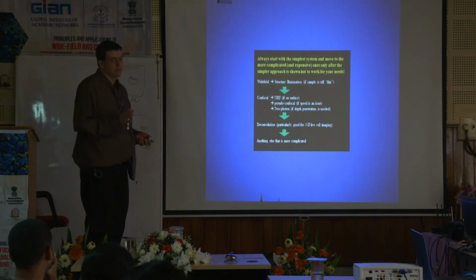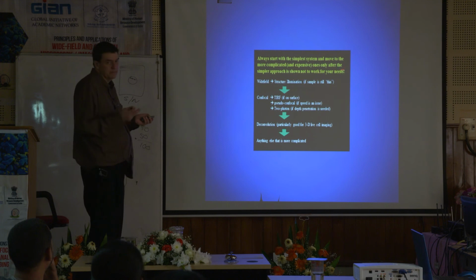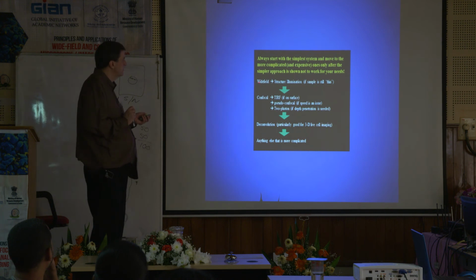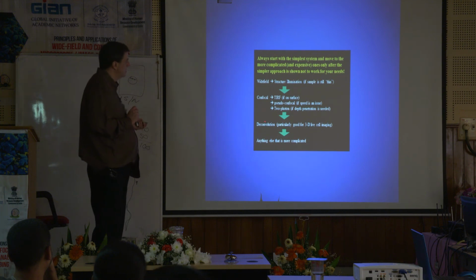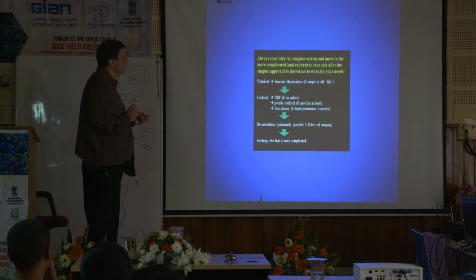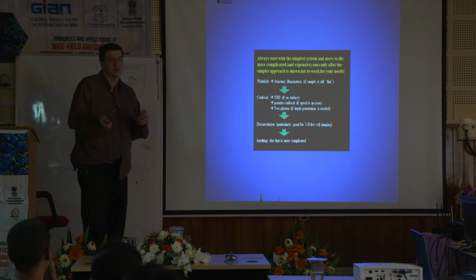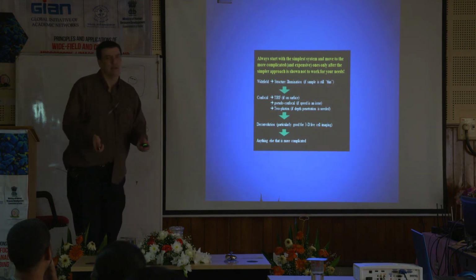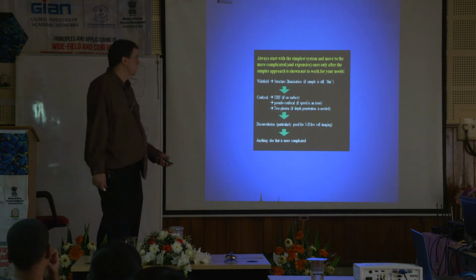So again, to reiterate where we started today, start with something simple. If simple works, why go crazy? Why spend the money? Why overdo it if you don't have to? So again, I really like wide field for a lot of stuff. Maybe structured illumination. Maybe deconvolution is your answer. We'll get into some of these other things, TIRF and these other confocals. But even if we're going to go to the confocal ultimately, I always tell people, hey, bring it over to wide field, let's take a look. Let's make sure the experiment worked. Why go to the confocal, spend the money, spend the time to get over there to say, oh, it didn't even work? So at least use the wide field to get an answer to start with.